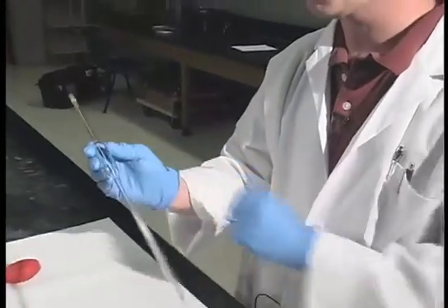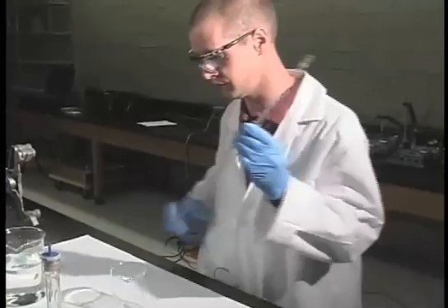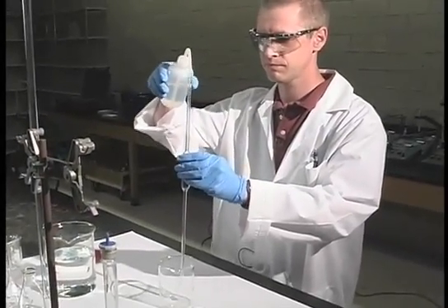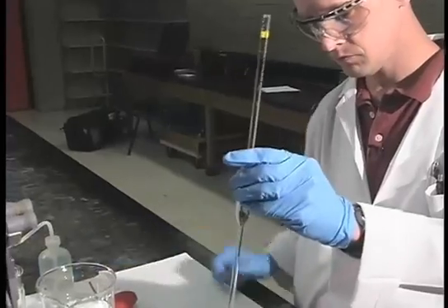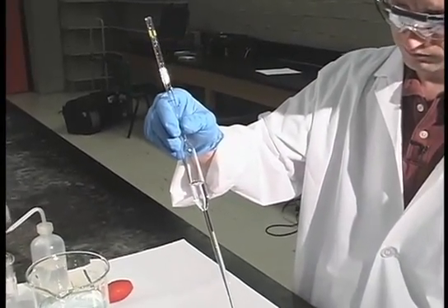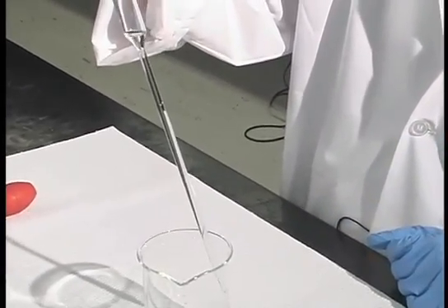Before you use it, you have to give it a rinse with distilled water to make sure that it is clean. Normally you want to do this three or four times, but we'll just do it once.